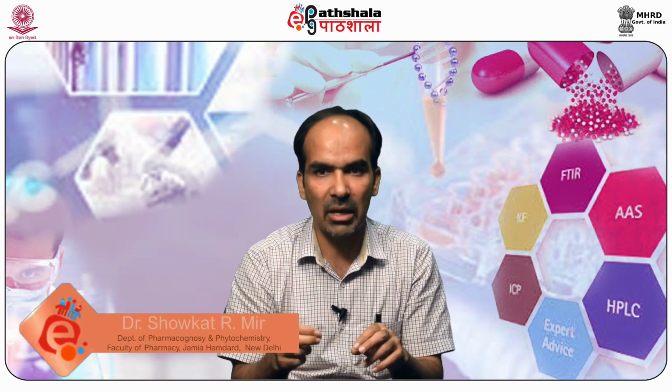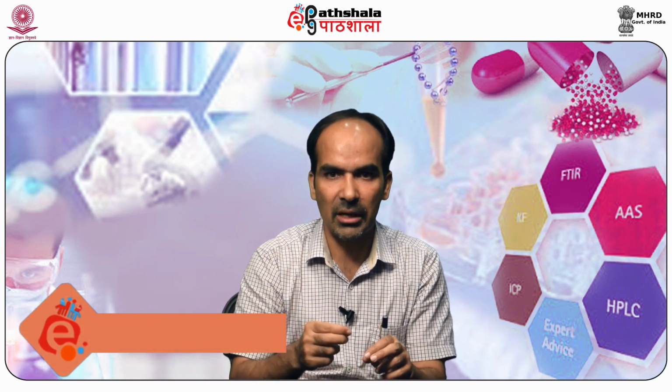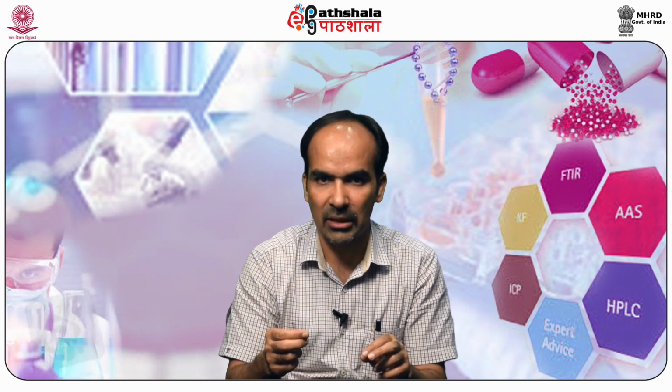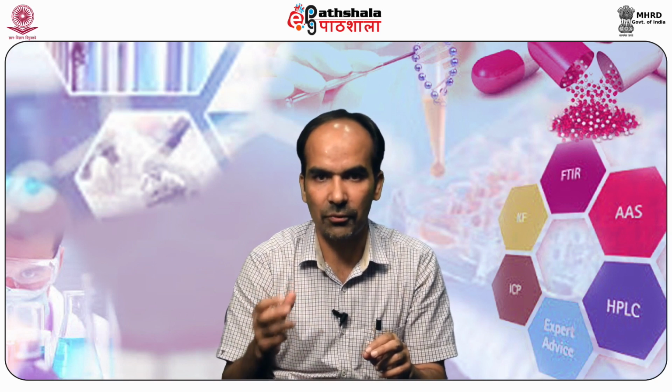NMR and tandem mass spectroscopy are used nowadays in natural product analysis vis-a-vis metabolomic studies, and they hold a good future.